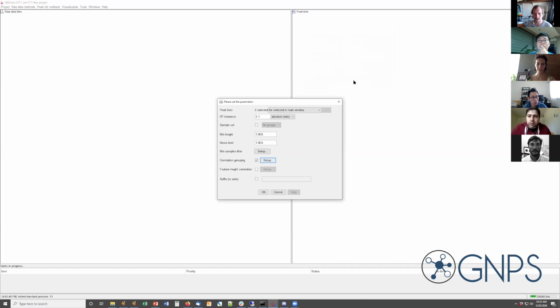Then the number of data points is correlated with the number of spectra per second, right? No, it's the total number of MS1 spectra that contribute to a peak. If you have a very long HPLC run, then your duty cycle time might not be so critical. But in our case, we have a 10-minute gradient and very narrow peaks, so you want to have a fast scan speed. Does that make sense? No, I didn't get it.